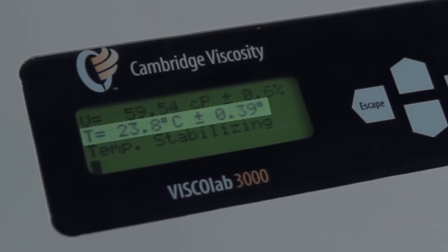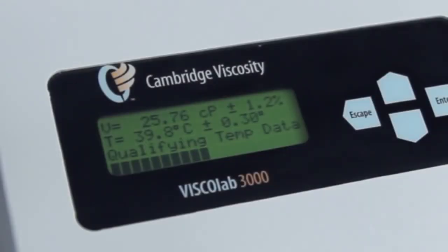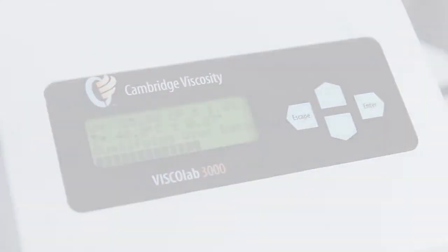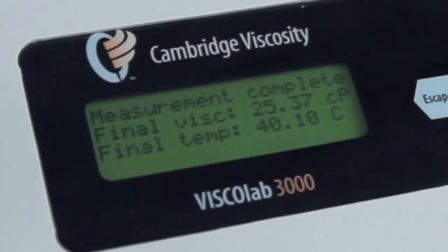Step 1 — Temperature stabilizing: the temperature must be within the designated tolerance of the temperature set point; default is 0.2 degrees Celsius. Step 2 — Viscosity stabilizing: wait the specified time for viscosity to settle before taking data. Step 3 — Qualifying temperature: wait for the temperature and standard deviation to drop below the programmed set points. Step 4 — Collecting data: the system will collect 20 viscosity data points. Step 5 — Qualifying data: the system will collect 20 more data points and compare to the previous 20 data points. Step 6 — Report data: the data will be displayed on the screen and the optional printer if enabled. The final viscosity and temperature readings will now be displayed on the screen.